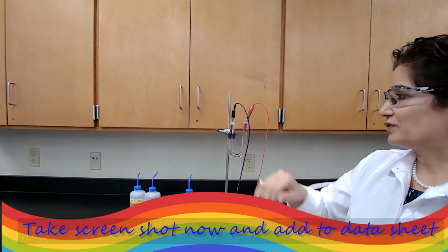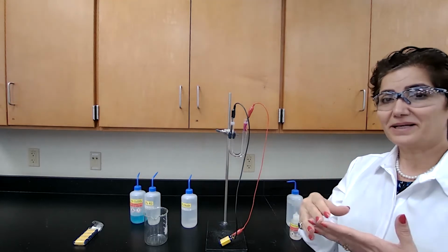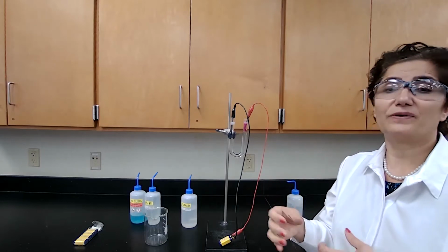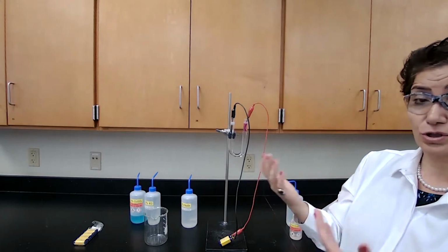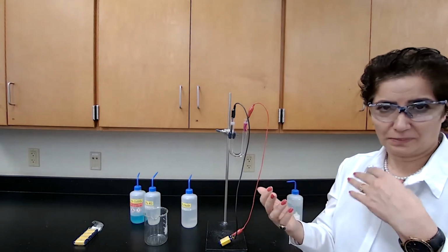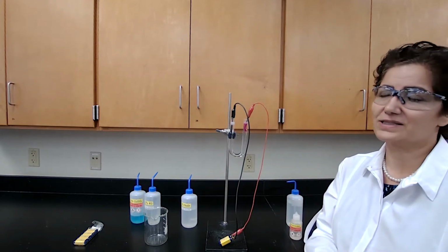What are the choices for oxidation? What can be oxidized here? We have two choices, one of which is eliminated because we already know water is being reduced. Either water is oxidized to give H plus ion, for which I would need another indicator to show that H plus has been produced, or we could go with the process of elimination. We say water has been reduced, so we know that water is not being oxidized here.